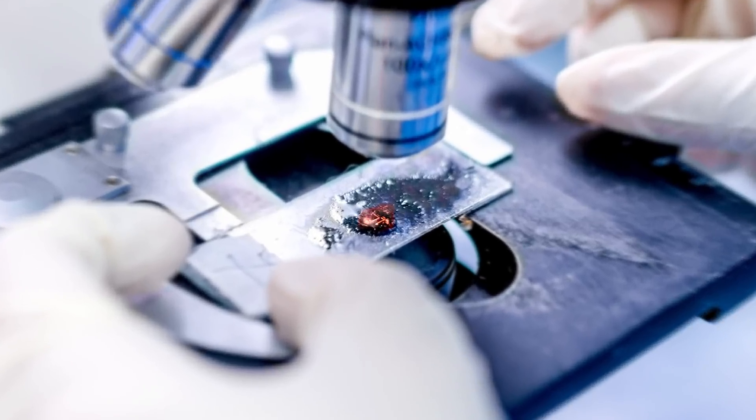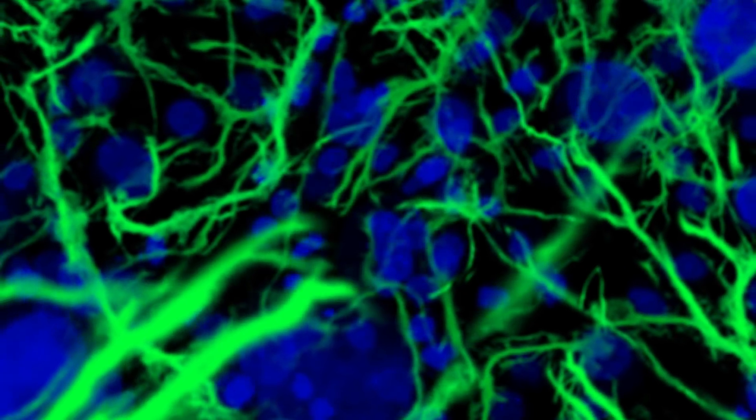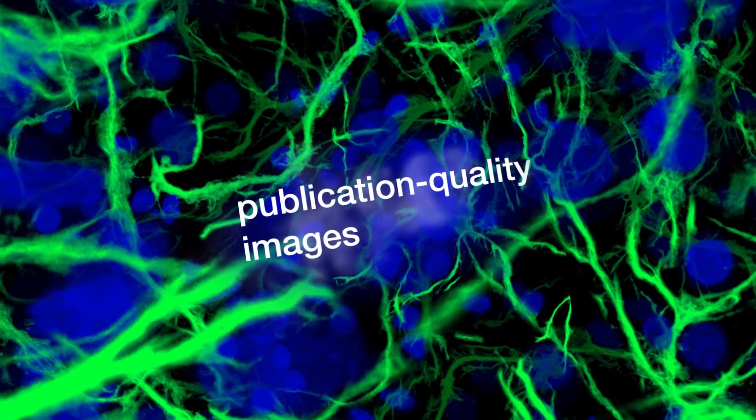Are your imaging experiments coming back with high background again? Do you notice cross-reactivity? There has to be a better way to elevate your results to create publication quality images.